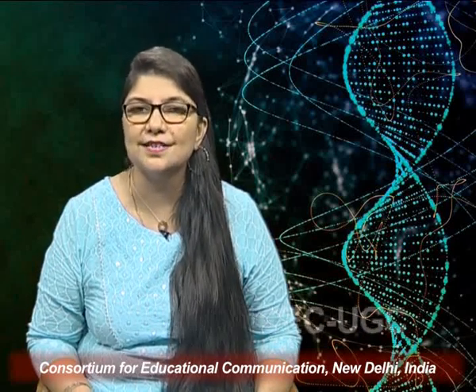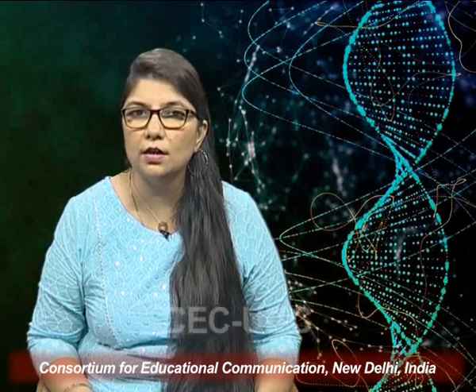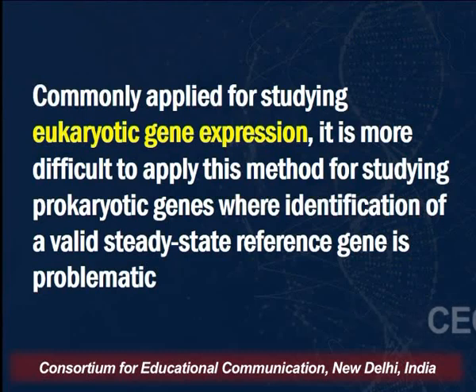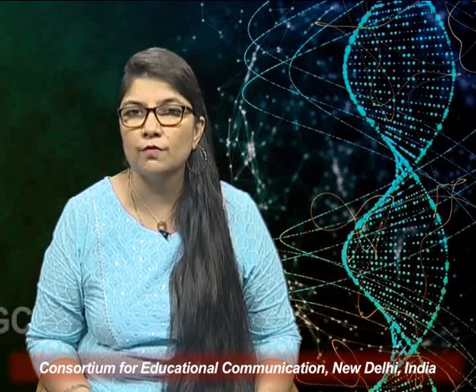So you can co-amplify those genes, and because they are steady state, you can correlate the number with the CT values, and by comparing, the unknown concentration of the template can then be calculated. This is commonly applied, as I said, for studying eukaryotic gene expression. It is more difficult to apply this method for studying prokaryotic genes, where identification of a valid steady state reference gene is problematic. However, as an example, the 16S rRNA gene can probably be co-amplified for studying the relative concentration of the unknown target gene by the quantitative PCR method.